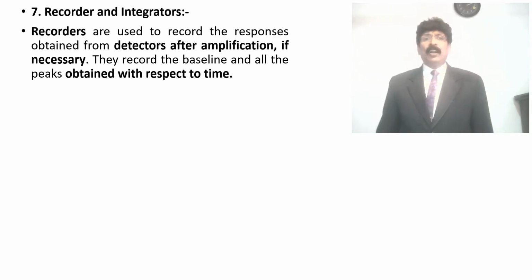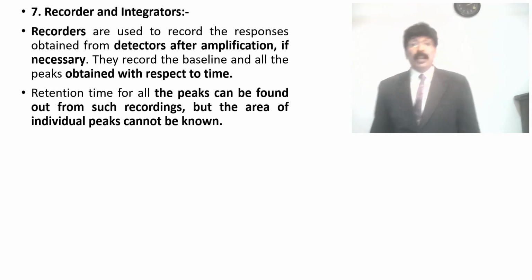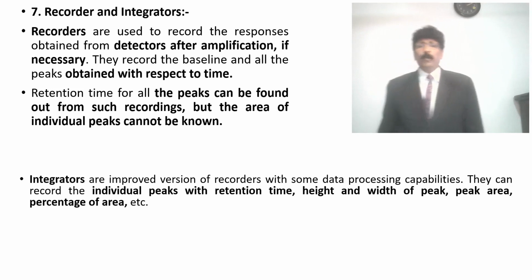The recorder shows the baseline and all the peaks obtained with respect to time. Retention time for all the peaks can be found from such a recording, but the area of individual peaks cannot be known. Integrators are an improved version of recorders.